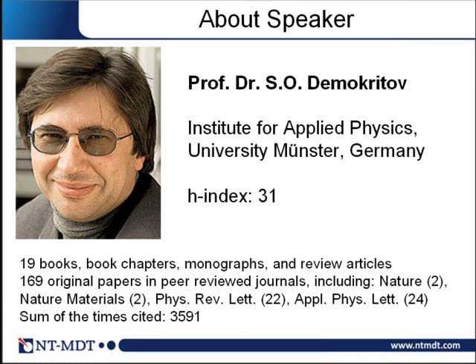I spent several decades working in magnetism, including magnetic force microscopy and magnetic dynamic microscopy, but today I will be talking mainly on standard application of magnetic force microscopy, and we will learn different techniques, the advantages and disadvantages of this technique, and we will see different examples of applications.